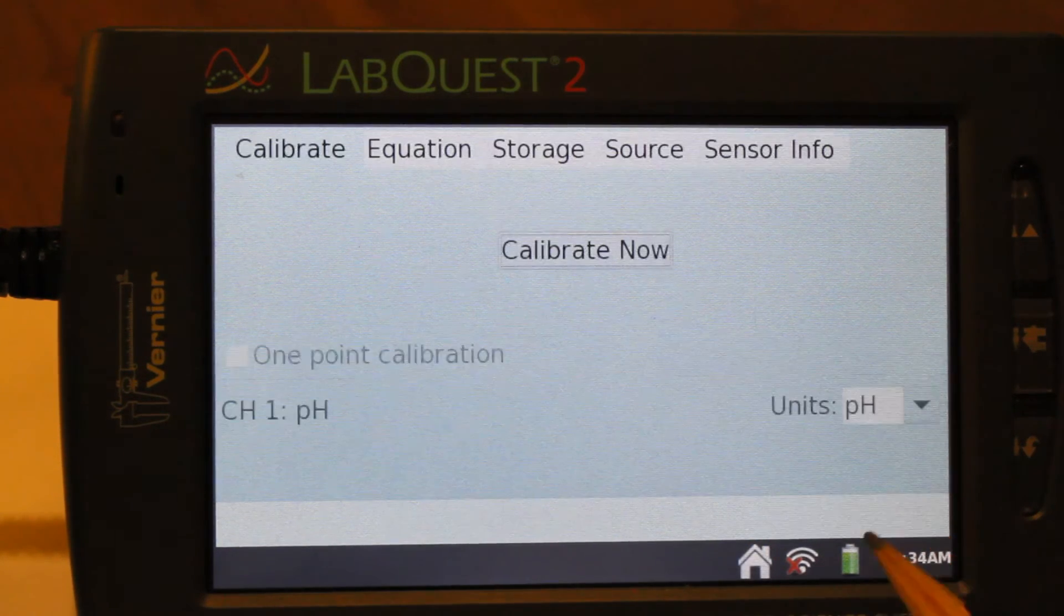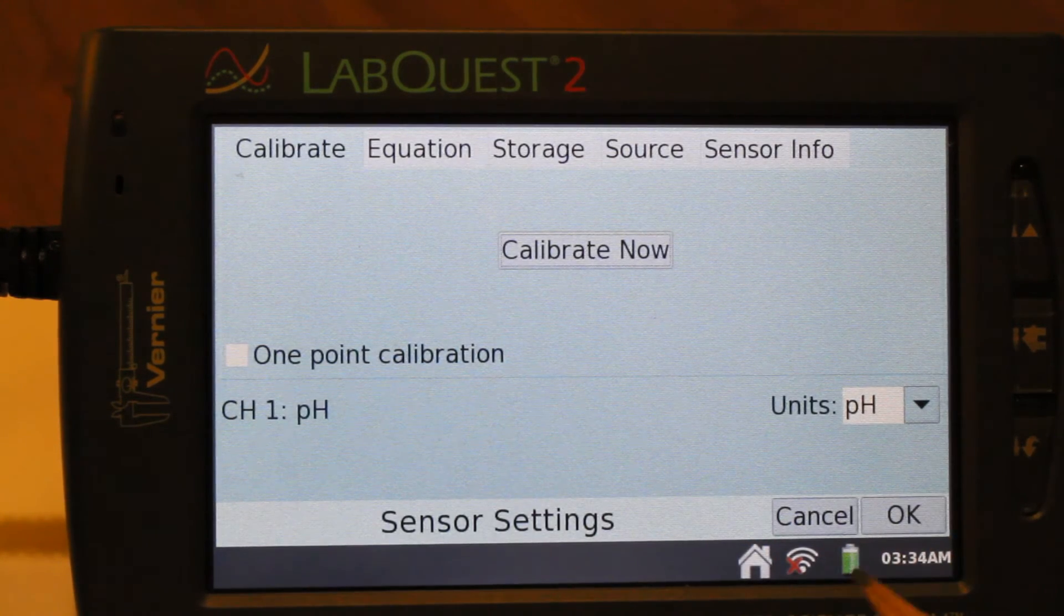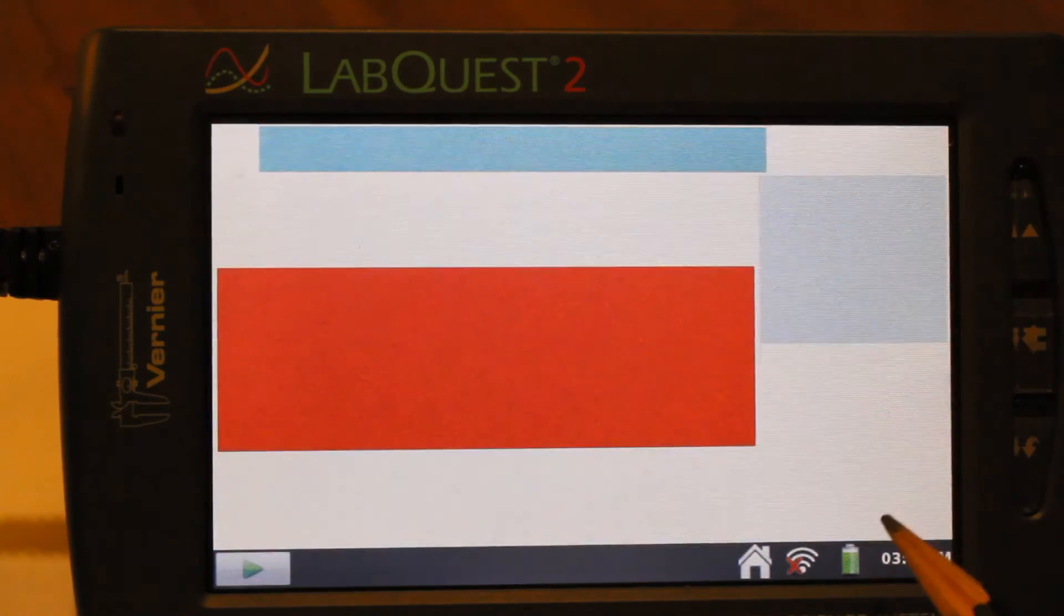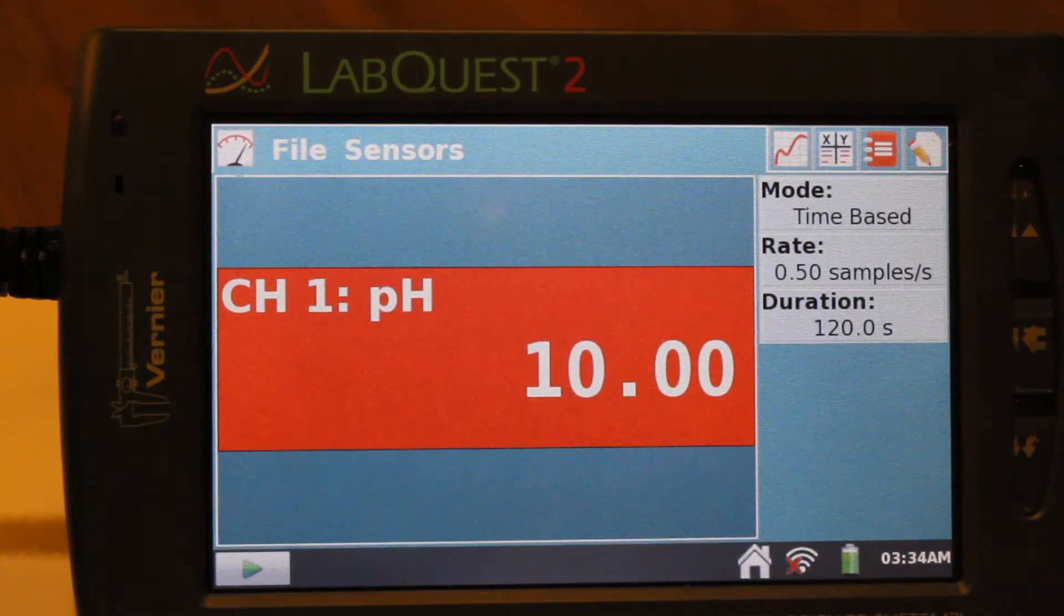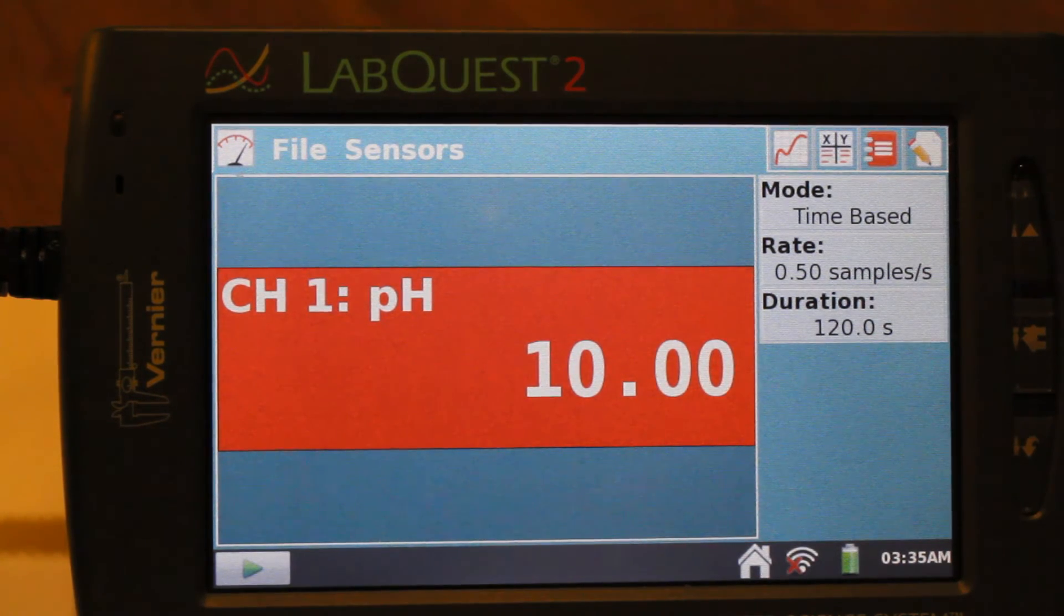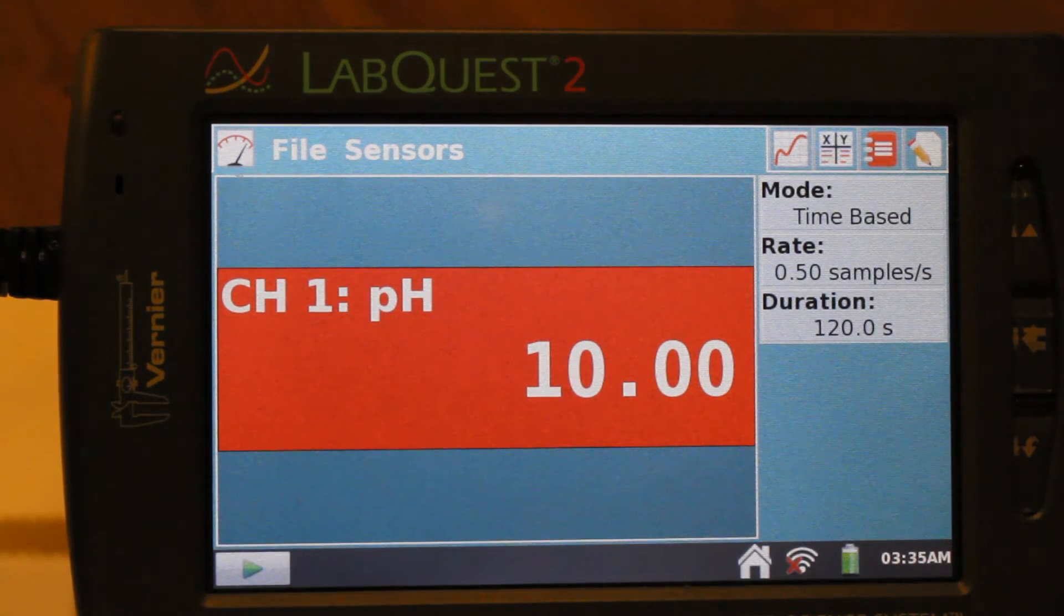Click keep, followed by ok. LabQuest is now calibrated. You can now use it to measure pH of solutions or generate titration curves.